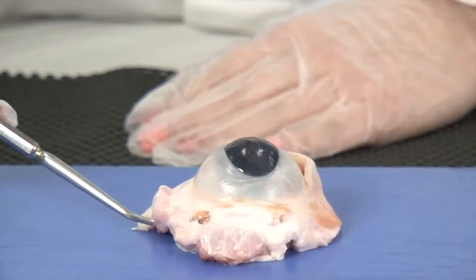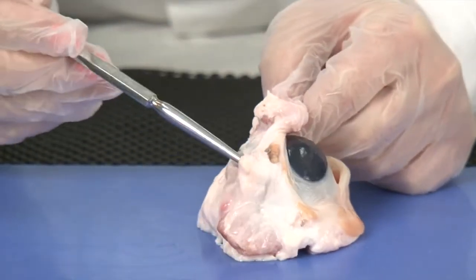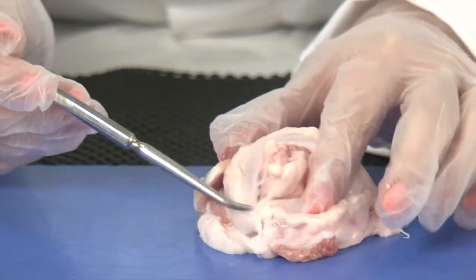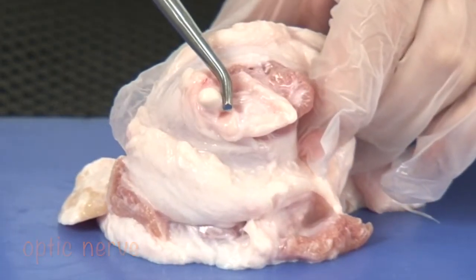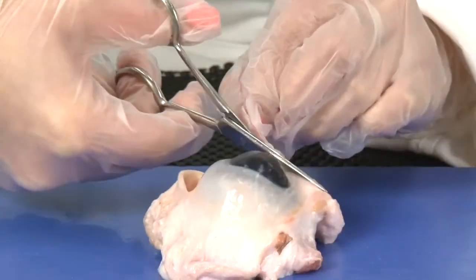Examine the fat, muscles, and optic nerve. Remove as much of the outer fat and muscle as possible.